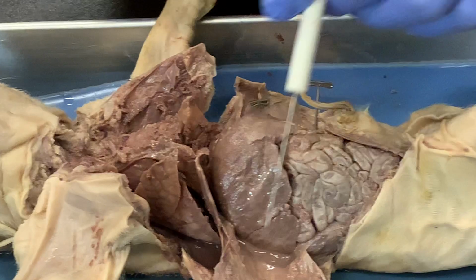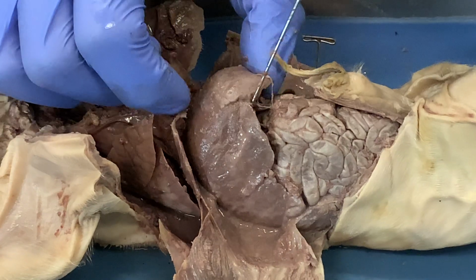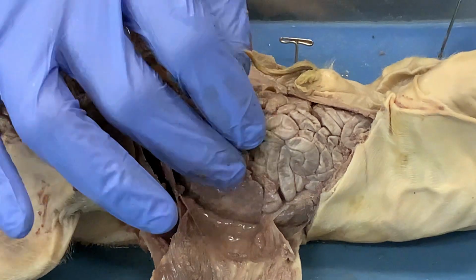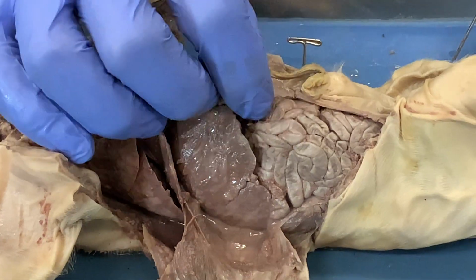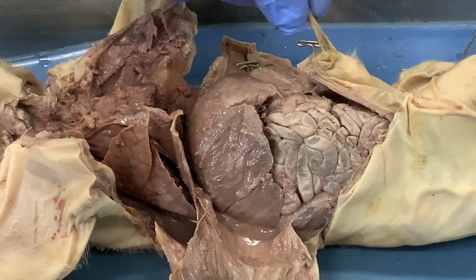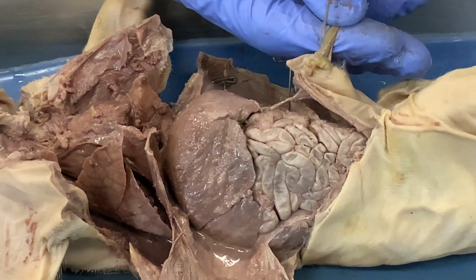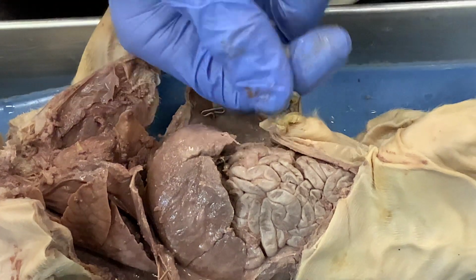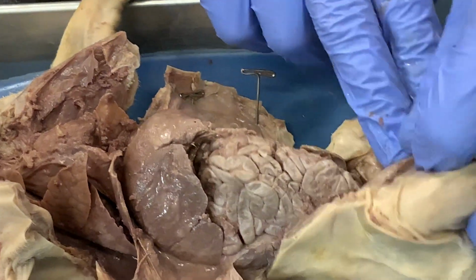Going below the diaphragm, again, the organ nestled right against it is the liver. Also quite a bit larger, especially in a fetal pig, than on the frog, because that's actually where the blood vessels that come from the umbilical cord go. So this is its primary metabolic organ rather than the stomach when it's in utero. You can see that blood vessel right here, connecting from the umbilical cord to the liver. Now, so that we can look at the rest of the abdominal cavity, I'm going to cut that so that we can move the urogenital tract out of the way.